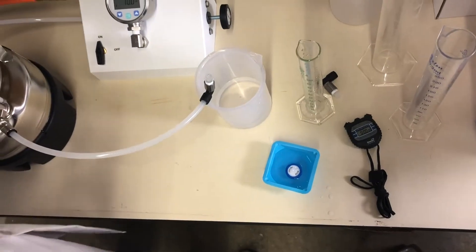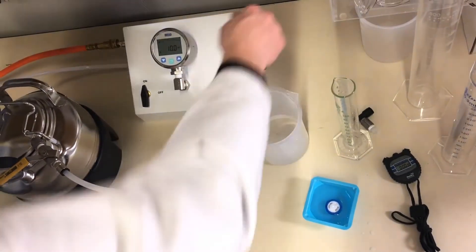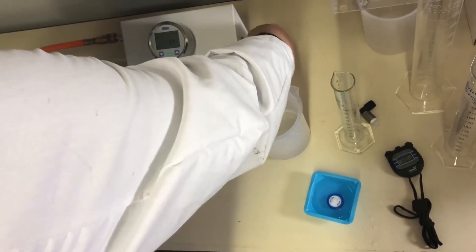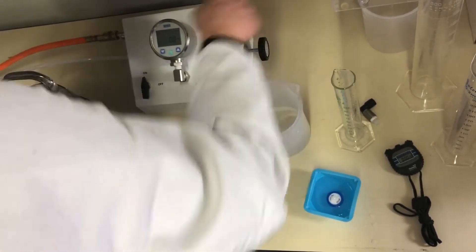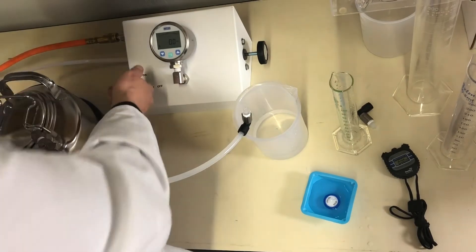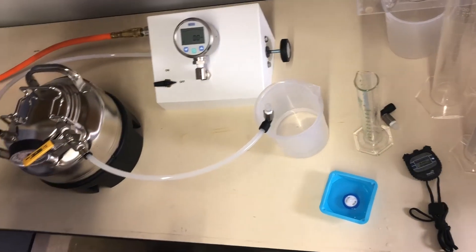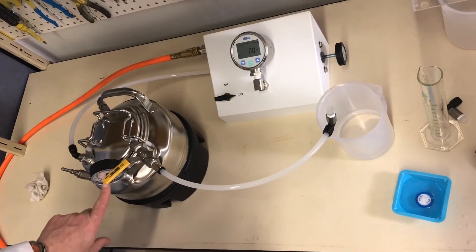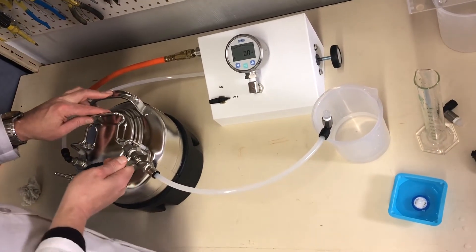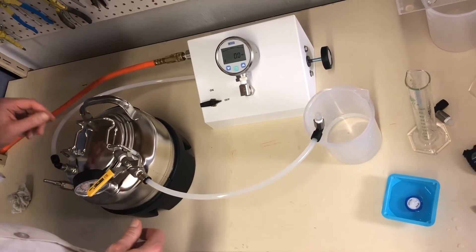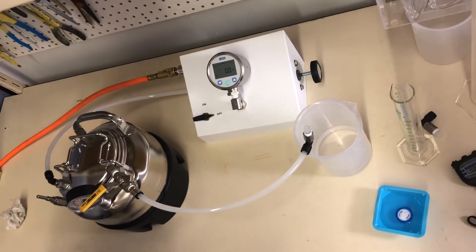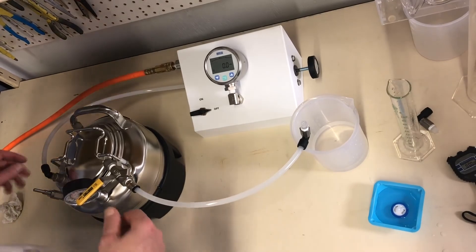And then when we're finished flow testing, we adjust the regulator all the way out until the gauge reads zero. Turn the tester off. Open the vent on the pressure pot just to make sure that it is indeed reading zero. That is safe. We're finished.